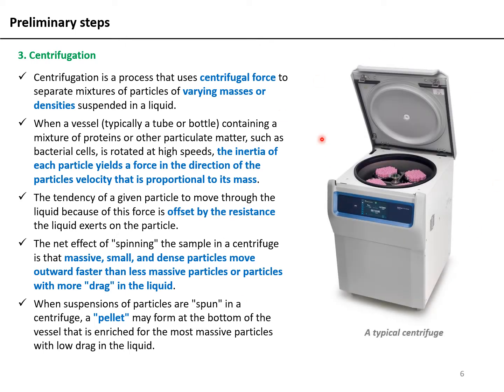So this is what a typical centrifuge looks like, and these pink things that you can see are basically the lids of several tubes, and each of these adapters is holding almost 40 to 50 tubes depending on the capacity of the particular centrifuge that you are using.